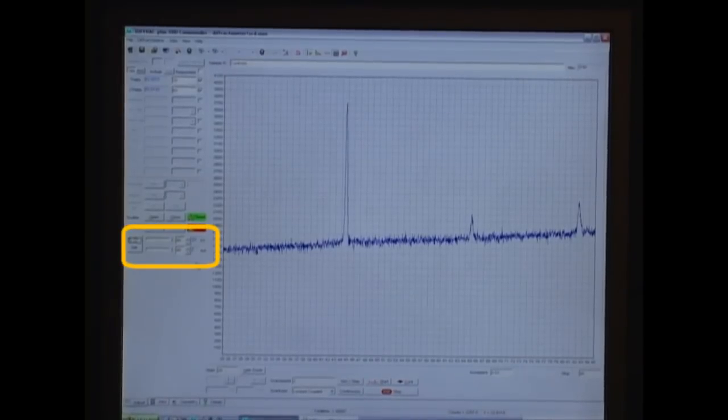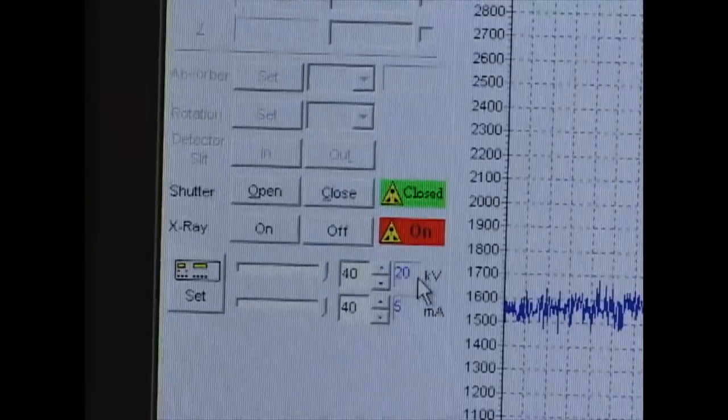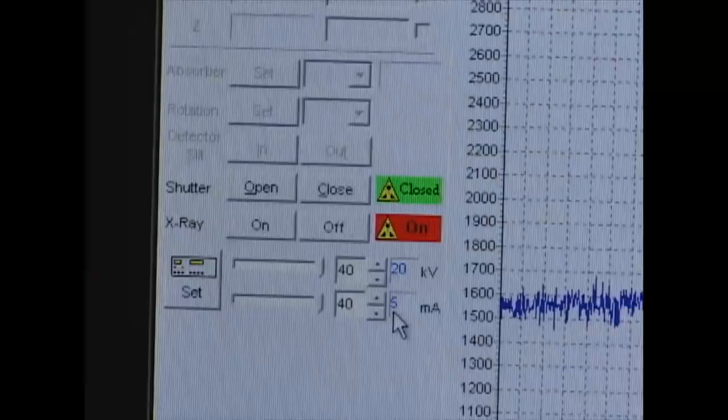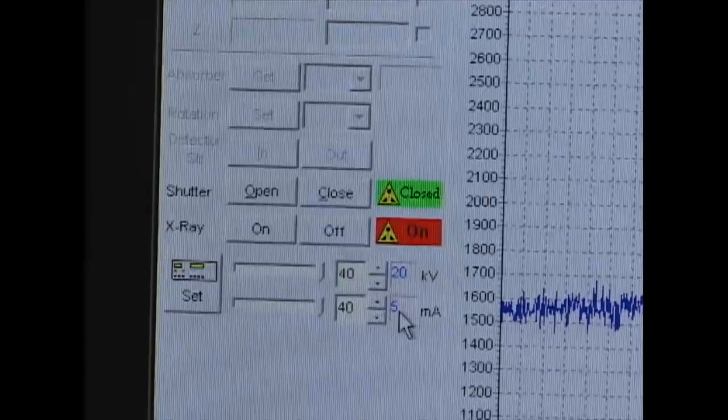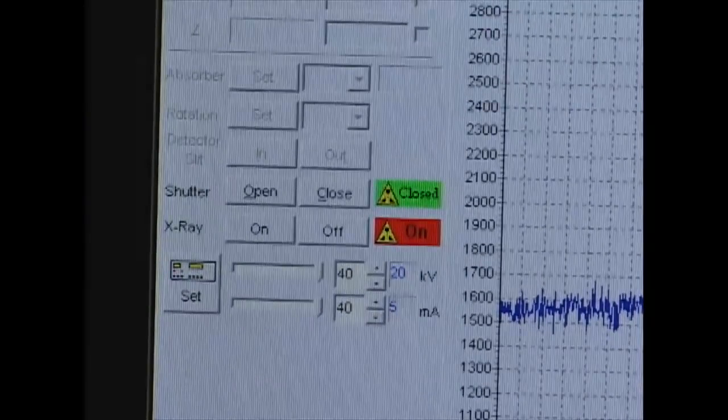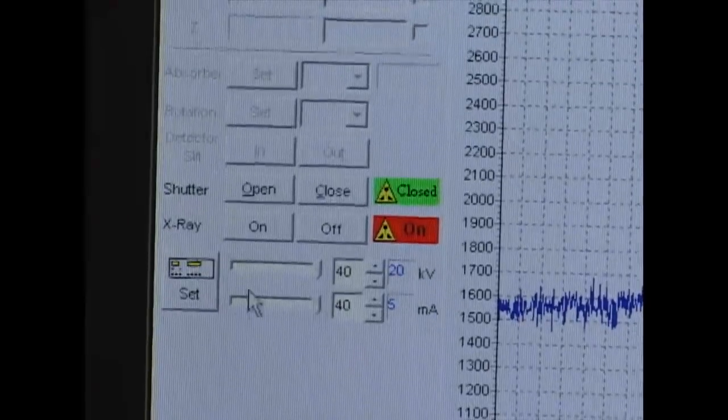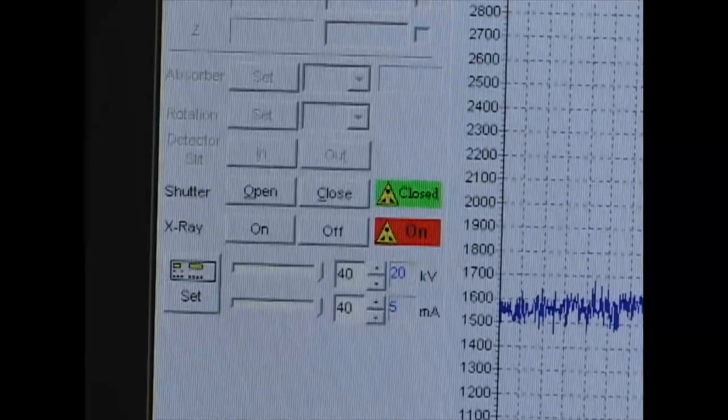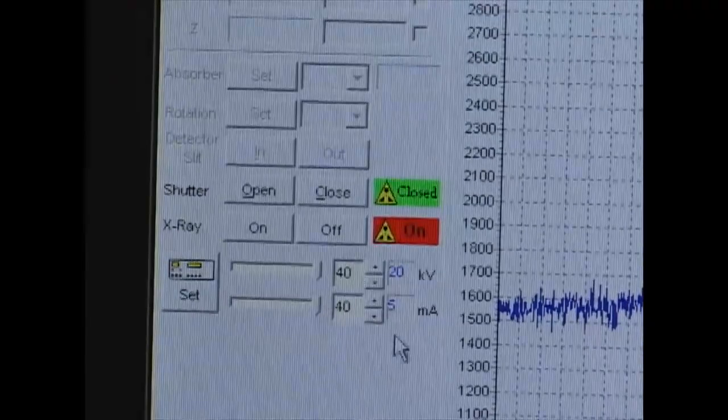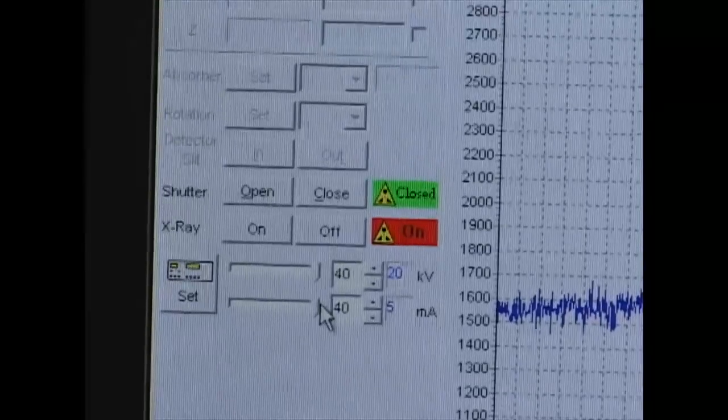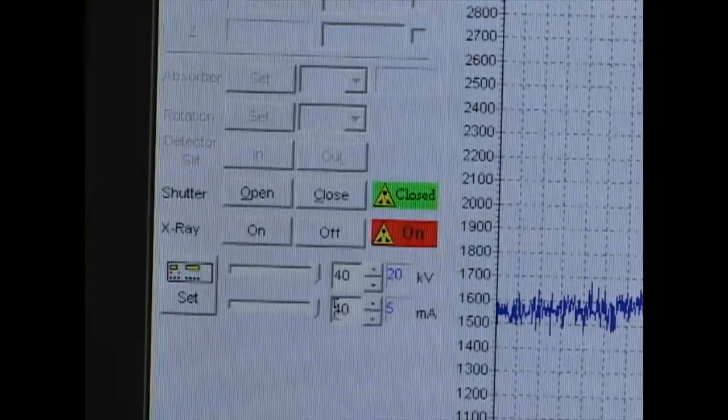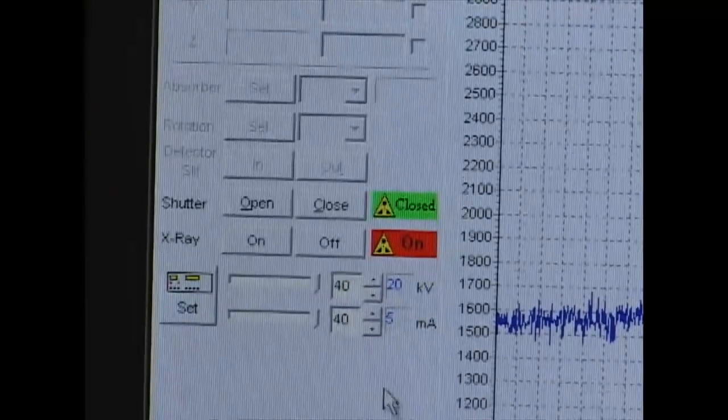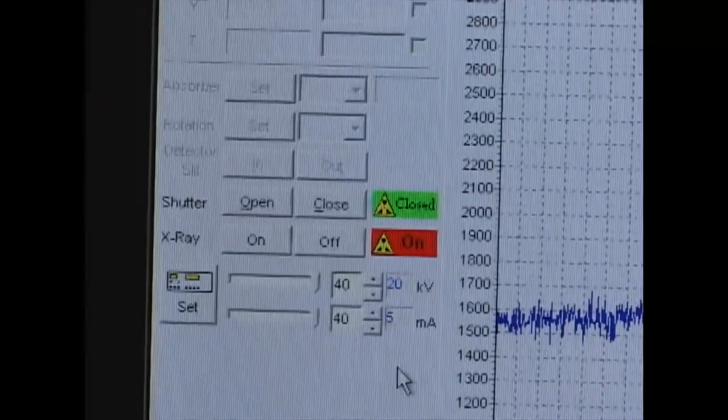This is where the power is changed by the user, where it says set. And you'll see that right now, the black is 40 and 40 kilovolts and milliamps. But the blue indicated here is the status. That's the current status of the power. At 20 kilovolts and 5 milliamps is standby status. If X-ray commander is not open, it will not go into this standby status. And the tube will be at maximum power for too long. And we want to extend the life of the tube as much as possible. So we want to be able to allow it to go into standby mode. It will do this automatically after 30 minutes of non-use.